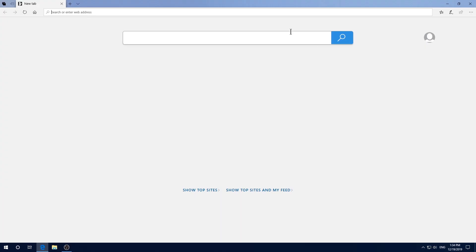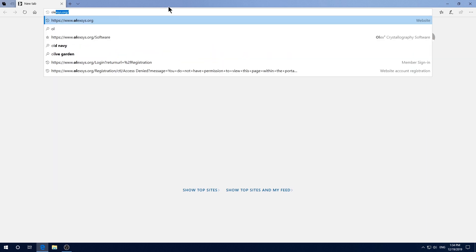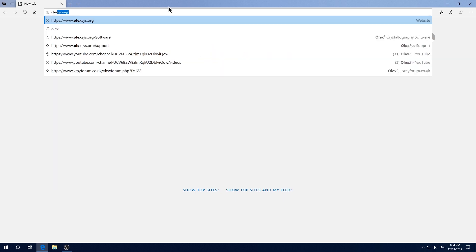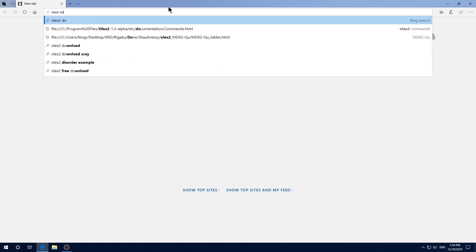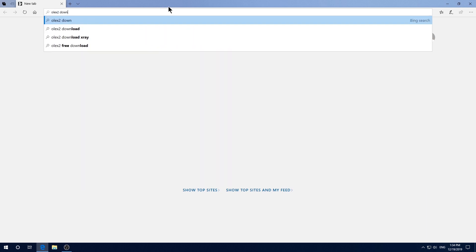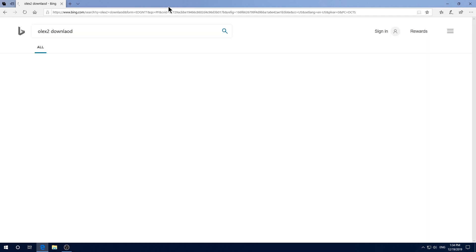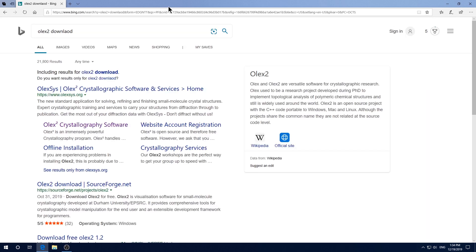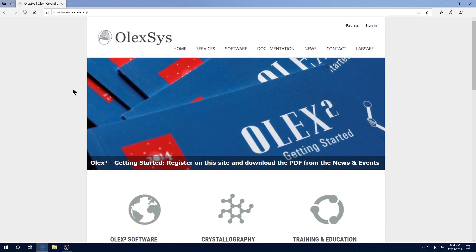Type in Olex 2 download in your favorite web browser, click on this website. As every other free software, you need to register in order to be able to download. However, this software is truly free and really great. So it is really worth a few minutes of your time to register.